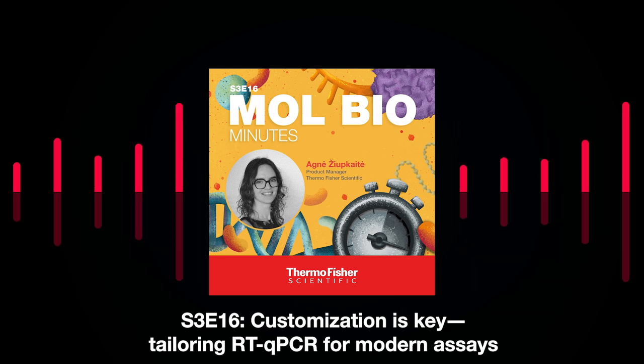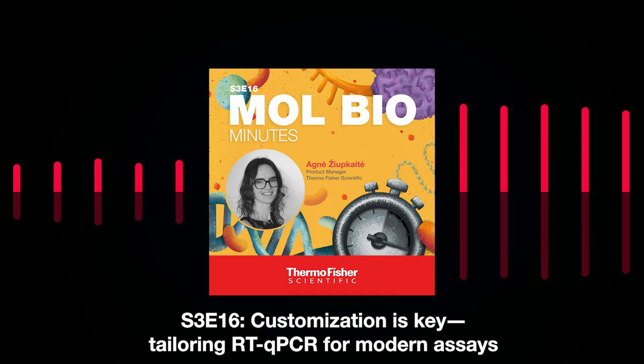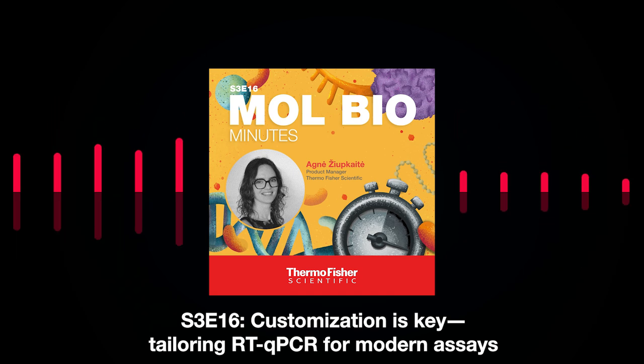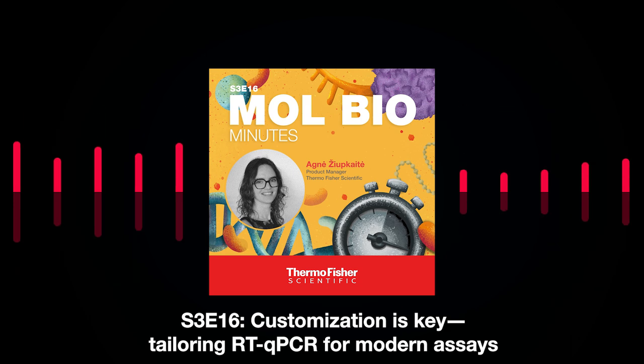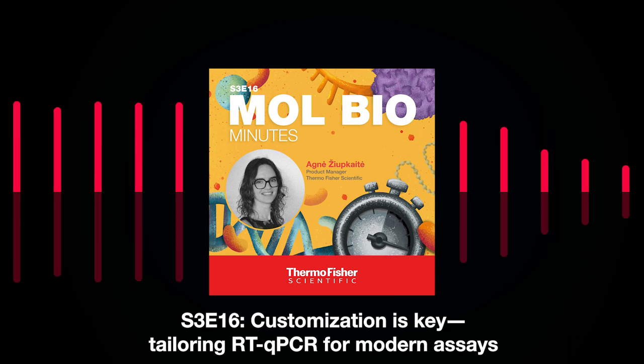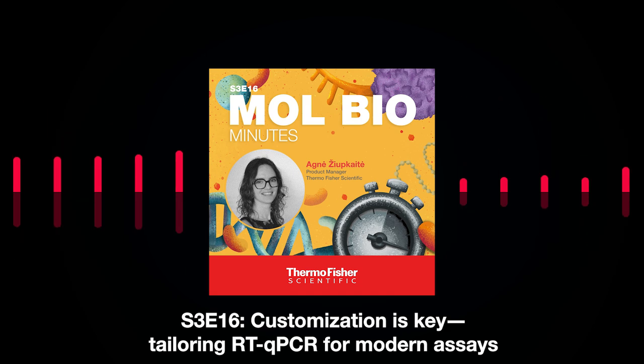Now that we looked at the two examples, let's look beyond these considerations and look more holistically at the challenges that might come. While the customization of RT-based molecular assays can vary significantly based on the specific application, several overarching challenges and considerations are universally relevant to all RT-qPCR assay development processes.